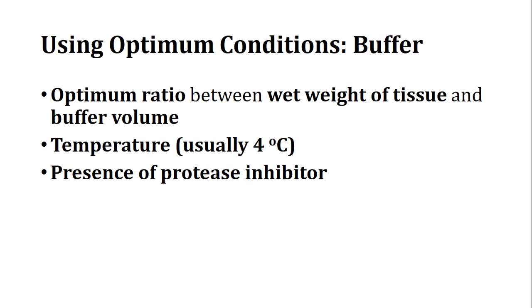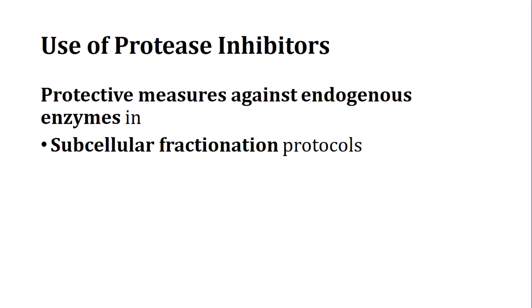Temperature is usually 4°C, because at this temperature most of the proteolytic enzymes are not functional, and additionally there should be a protease inhibitor. One thing we can discuss about protease inhibitors is that they have a protective measure against endogenous enzymes, enzymes that are formed internally, and the requirement is in the subcellular fractionation protocol. Because as we rupture the cell, there is a chance that protease enzymes are activated during the procedure.